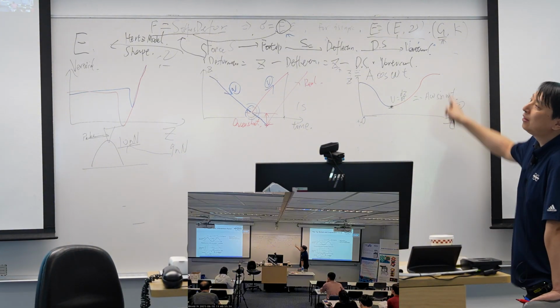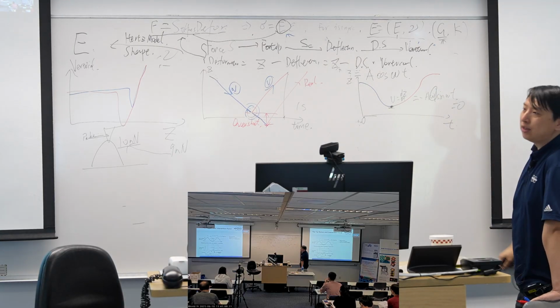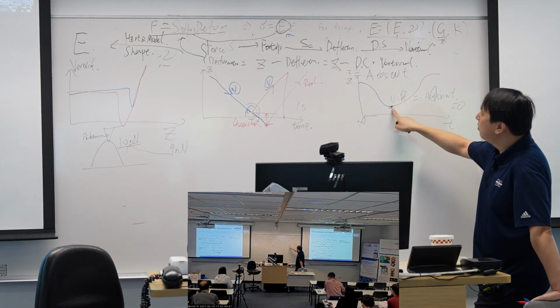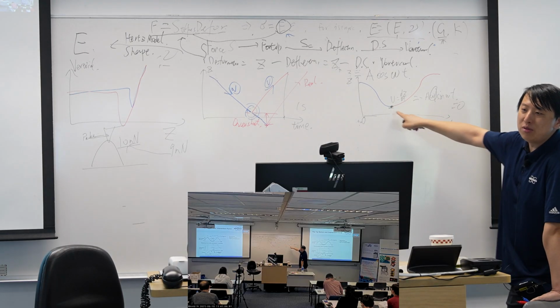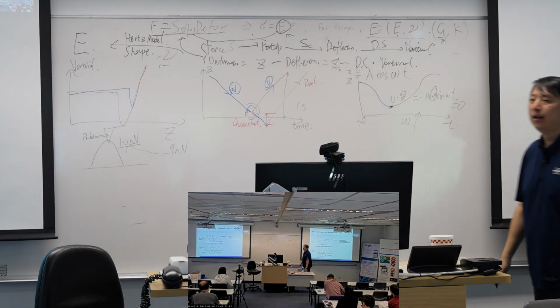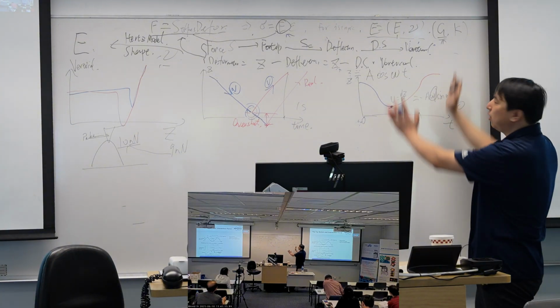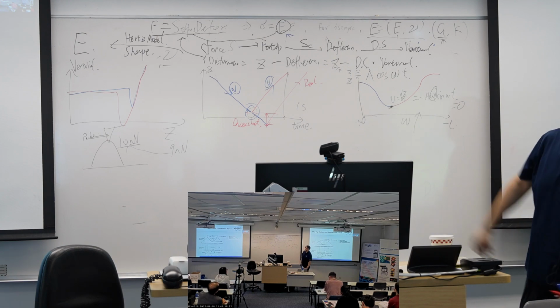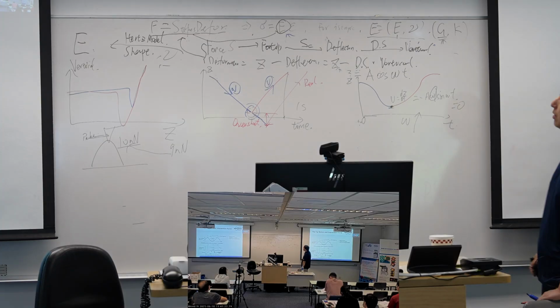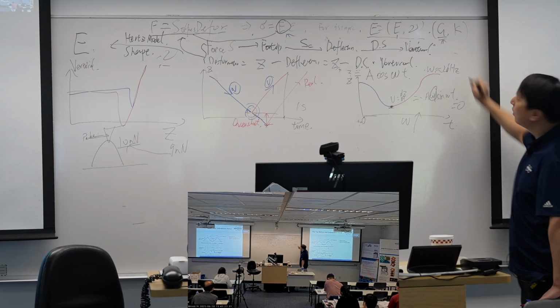So that's this idea. No matter how I change this velocity, how I change the frequency, it does not change the velocity at this point. It's always 0. So we can increase the omega, and once you increase the omega, you reduce the total time, and then you can do it quite fast. Usually in the common setup, the omega is around 2 kilohertz.